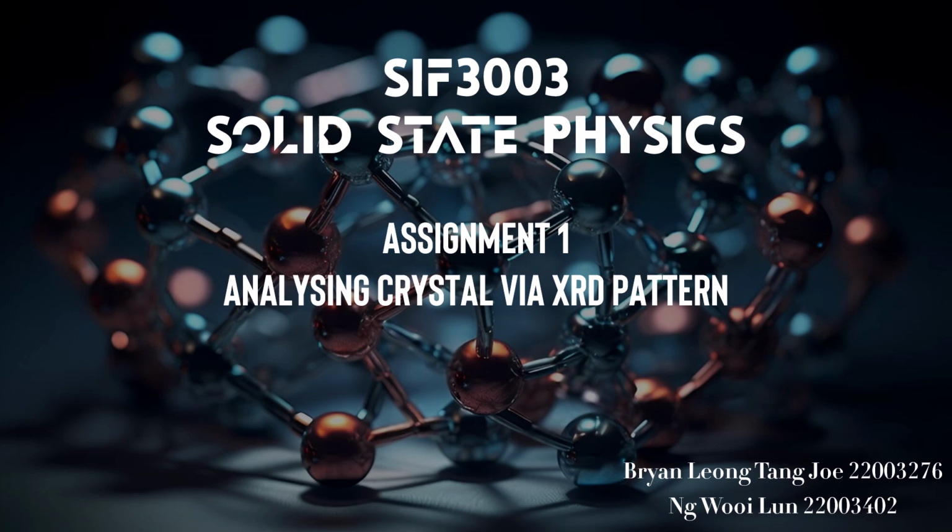My name is Wooi Lun. And my name is Bryan, and today we are going to analyze the XRD pattern of a crystal, with the sample being Ni3Si2.